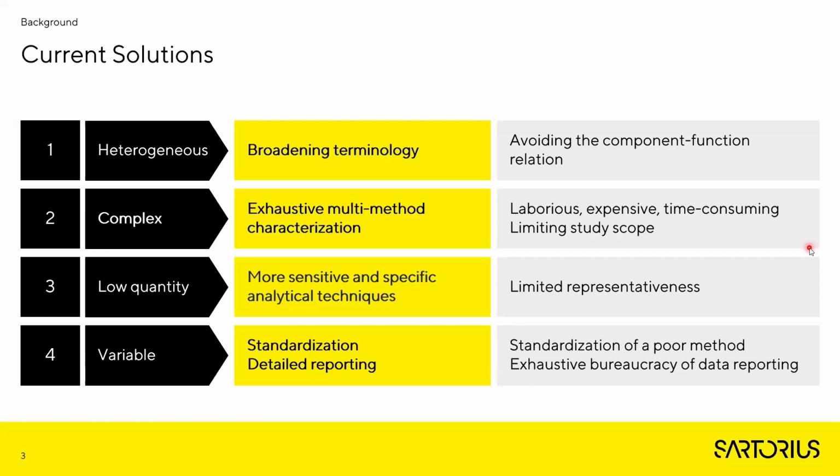There are also strong initiatives to standardize the procedures, to make the conclusions comparable among the studies. However, standardization is beneficial for the good methods.